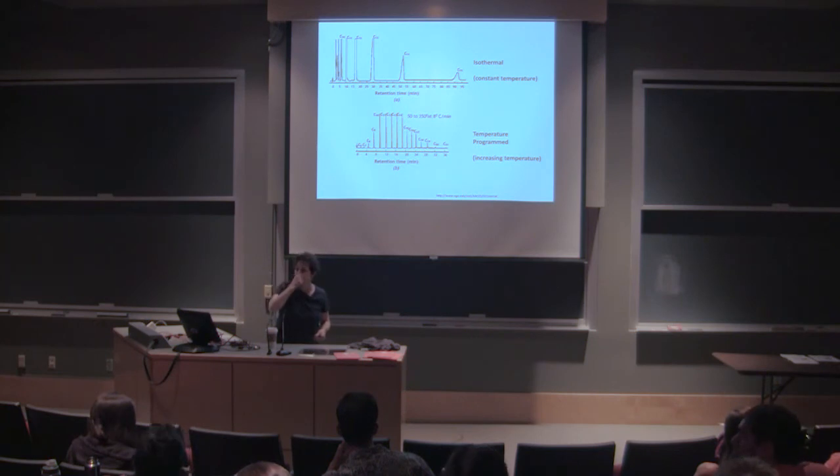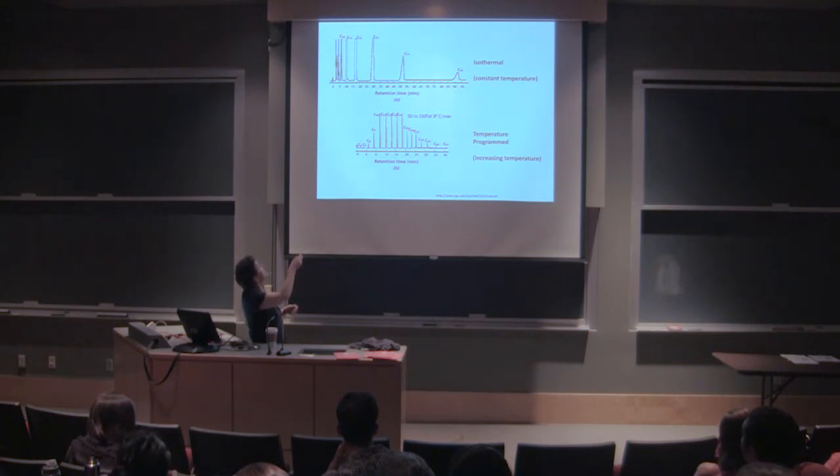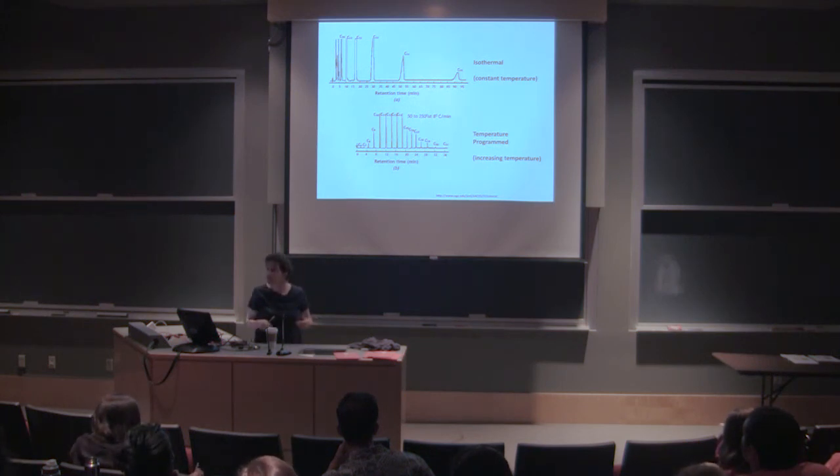What are the first two peaks before the C10 on the top? Is that the salt? They're not labeled. I suspect they're probably these other compounds down here, just because I think it's the same mixture.